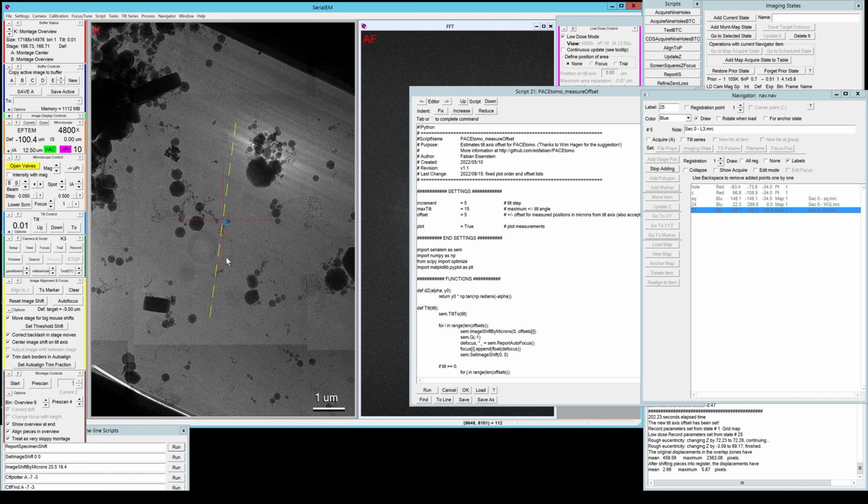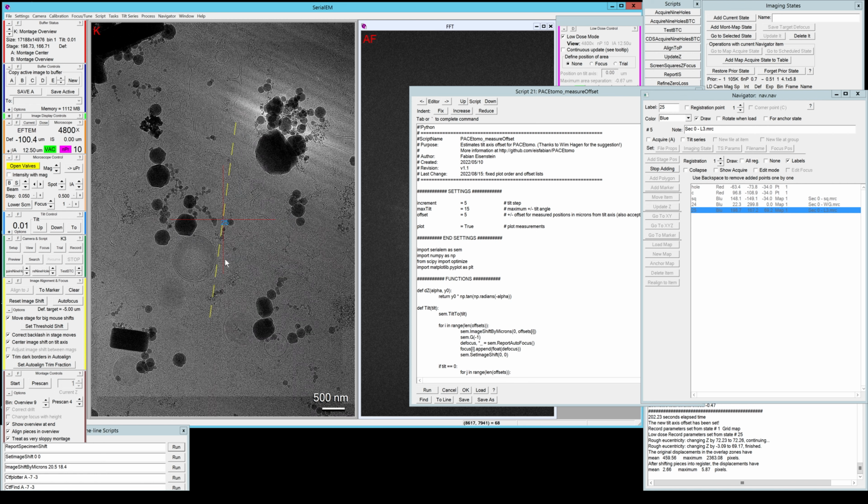So the first target is the important one. That's where most of the tracking will happen. That means that this target will still give you data and will still provide you with a tomogram with only one additional autofocus exposure. However, the tracking will be a little less precise, so you might lose a bit more field of view, just to be aware of that. So I wouldn't use my favorite target for the very first one.